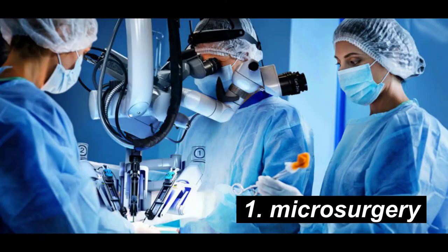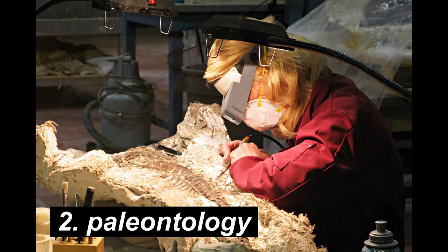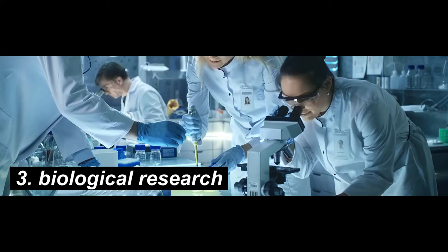Just now, we learned how stereo microscope works. So now, let's look at how we can apply stereo microscope in our life. And surprisingly, stereo microscope plays many roles in our life. Stereo microscope is used for microsurgery in many hospitals. In the paleontology field, it is used to clean and analyze fossils. It is also used for biological research purposes.